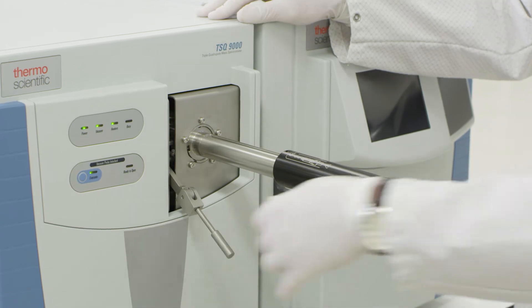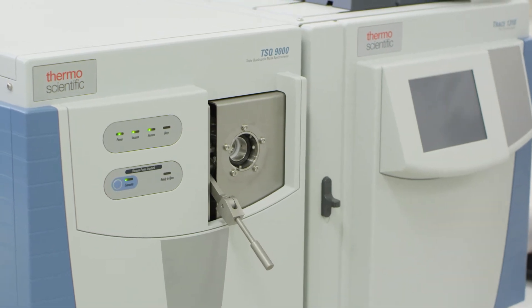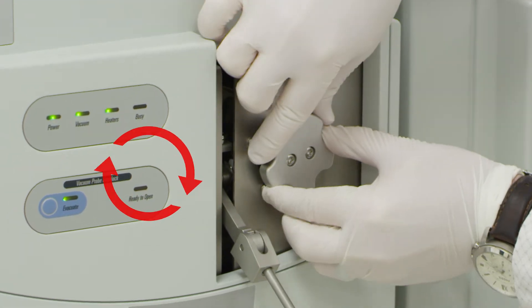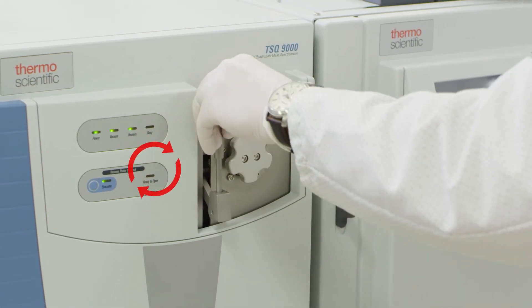Remove the source installation tool with the source attached by turning counterclockwise. Replace the manifold cap by inserting and turning clockwise until the cap clicks. Return the lever arm to the upright position and secure.